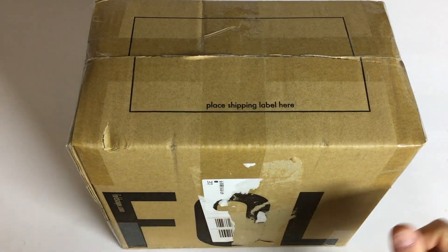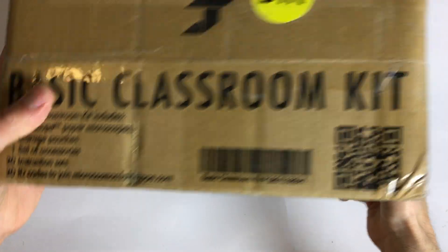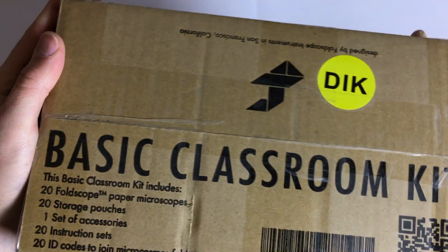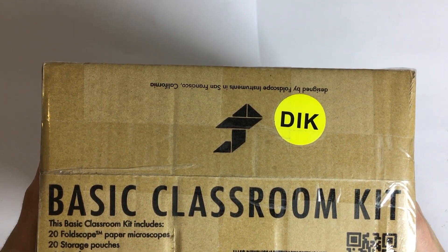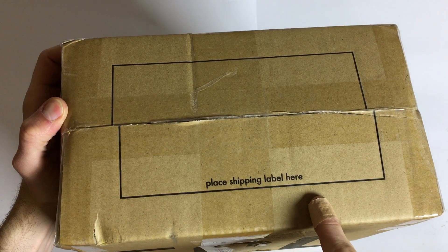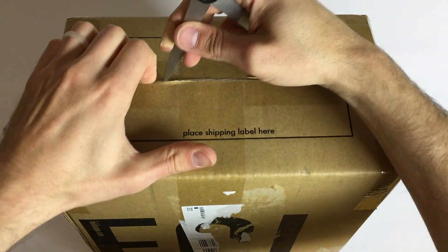So let's get it open. You see the marketers were quite strong with this — they actually put the naming on it like this. You can see it if you look. They put the name of China on it, and they actually bothered to show you what's inside. But one thing they messed up is 'place shipping label here' — and what did I remove here? The shipping label. No big thing, it's more hilarious than anything else.